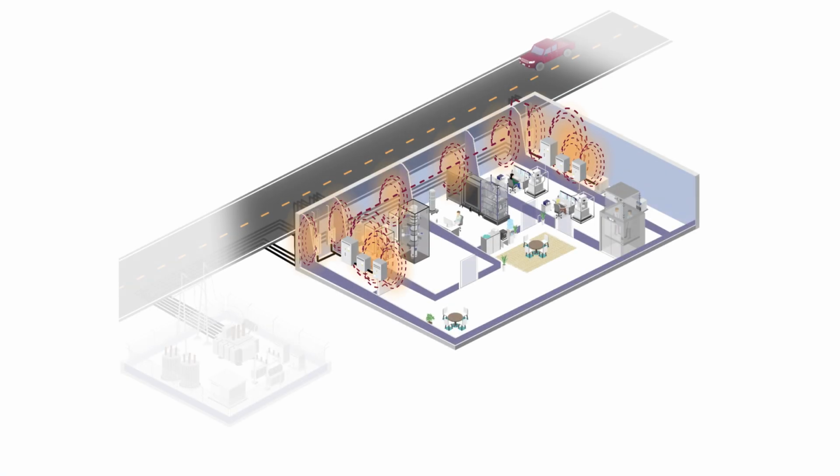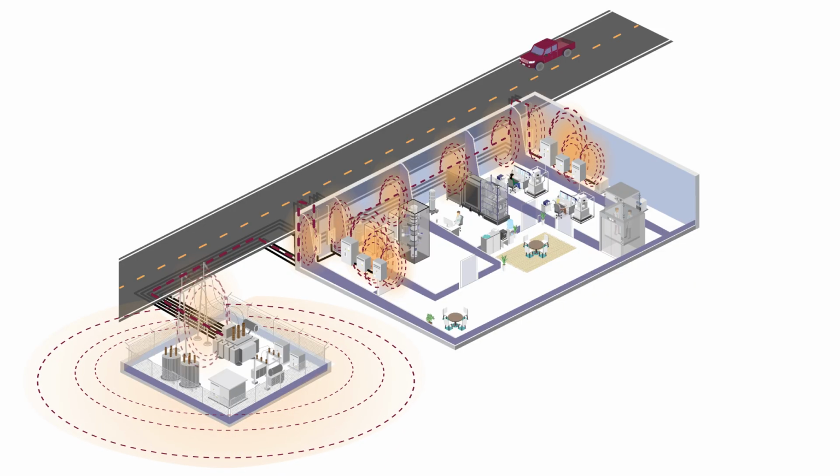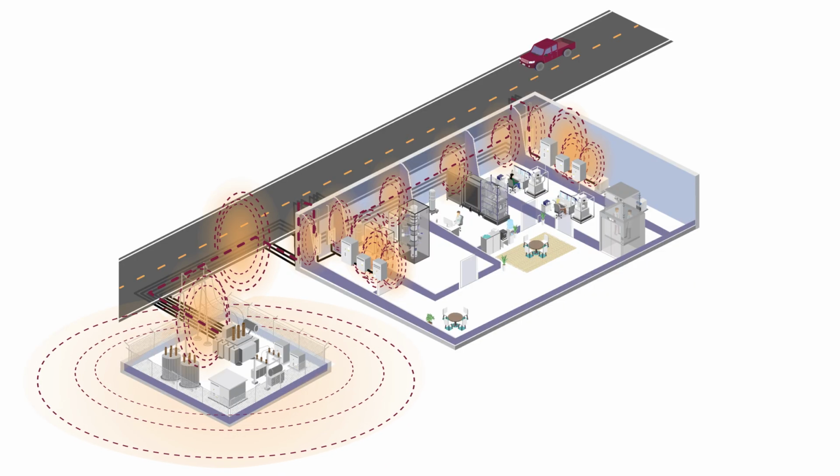In addition to inside the building where you have the feeder conduits between the electrical rooms, you also need to look at how power gets into the building, like the interconnect. We've seen examples where customers spend an enormous amount of time, effort, and money designing their facility to the highest EMI standards, while they'll have their TEMs located in a place where the main power for the street runs underground 30 feet away in PVC conduit. And so PVC conduit provides absolutely no attenuation whatsoever. If that PVC conduit is providing power to the entire street, it obviously has a lot of load, therefore a lot of current, and is a significant AC magnetic field source.